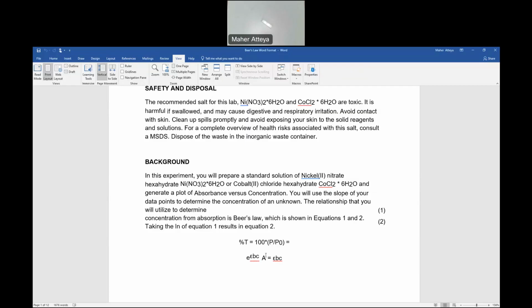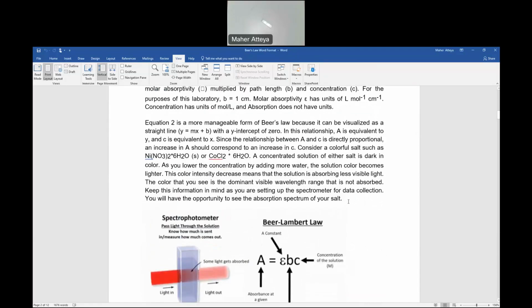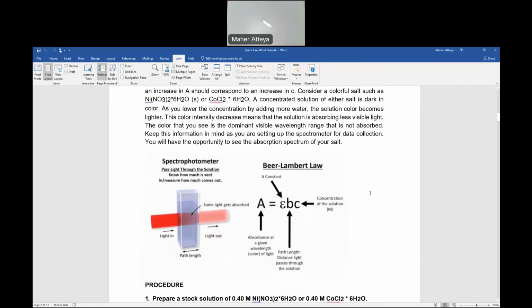So you know that the person died by poisoning, but you don't know the concentration of this poison. So you can run this experiment to learn about this. When I saw the experiment write-up, they don't show you all the details, so all this is my addition to the lab, so you can understand.